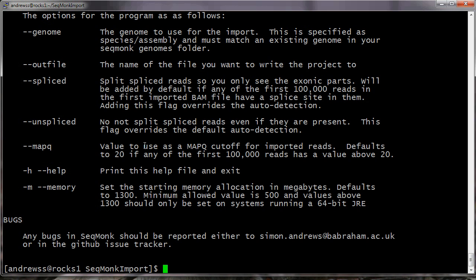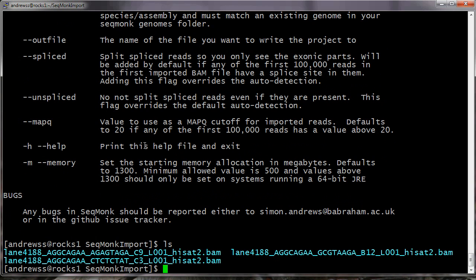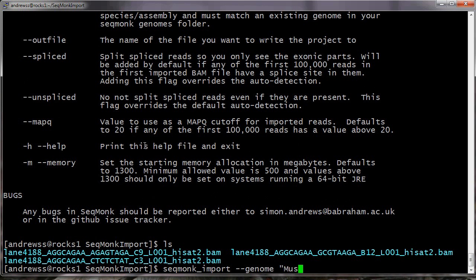OK, so let's have a go at that in the data that we're going to import here. So if I do seqmonk_import --genome, in this case these files were mapped against the mouse GRCm38 genome, so I need to put quotes around this just because Mus musculus has a space in it. GRCm38.